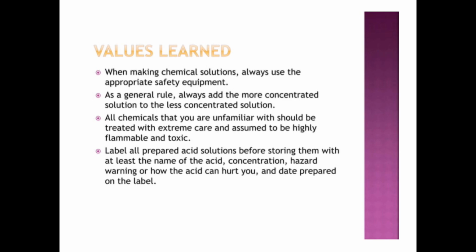And finally, in your information, also add the date that you prepared it, because over a long period of time, maybe the acid is not being used and it has reached some time, it may not be needed again. So they need to know the date so that they know if it's still valid, if it's still necessary to be used or not. Some will require that they prepare them freshly.